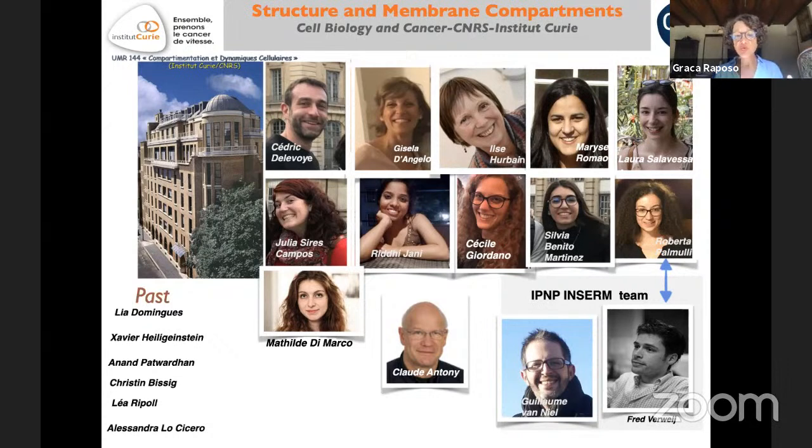So we took normal cytotoxic T cells isolated from a normal donor, and then we took the cytotoxic T cells from the patient. Then we asked, what is the first technique that we're going to use?